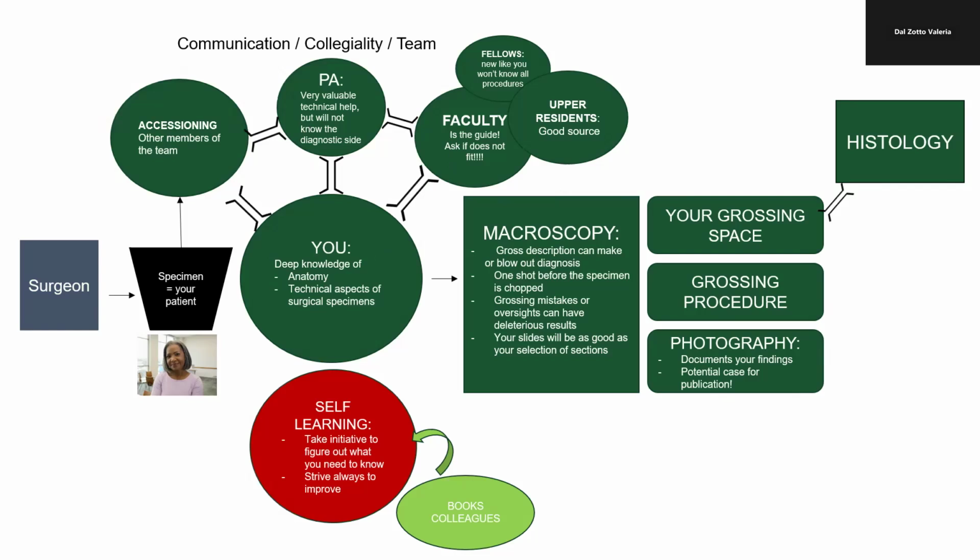You can page him or her as much as you want or need, and you can ask them questions. However, faculty sometimes are not present because we have other duties. So a good source of information is fellows and upper residents. Keep in mind that fellows coming from outside UAB sometimes don't know the entire breadth of the procedures, so I highly recommend you ask upper residents and PAs for help.